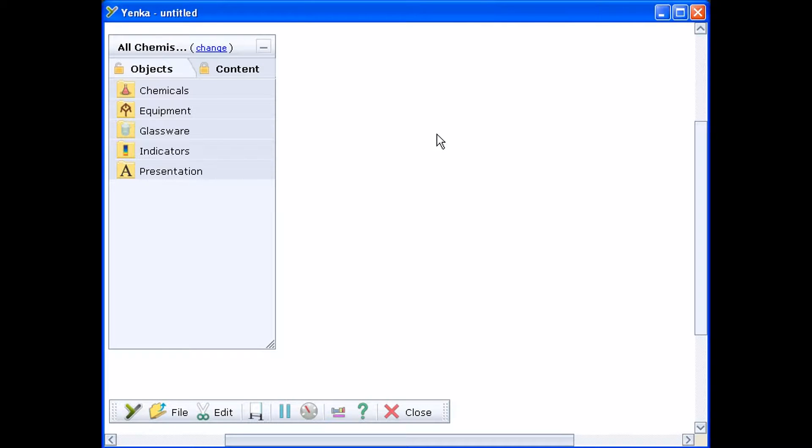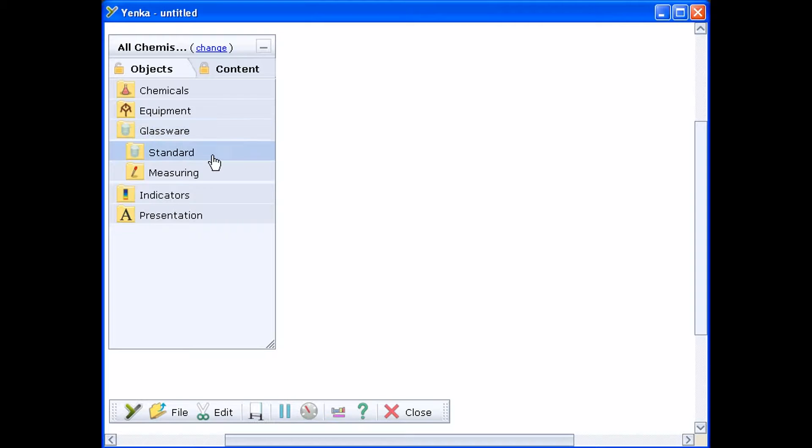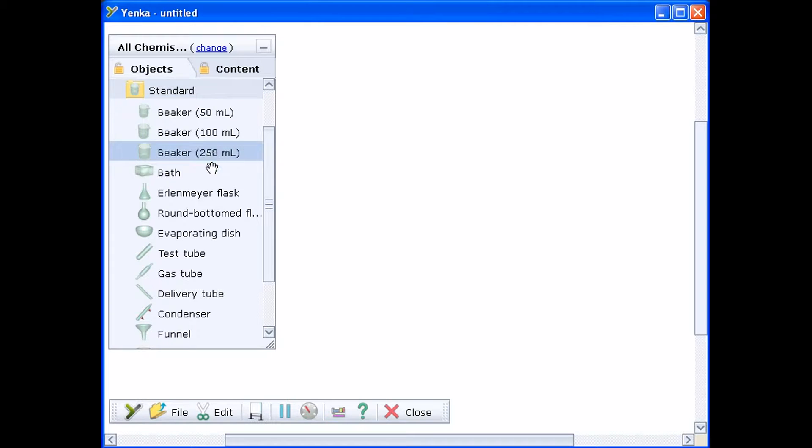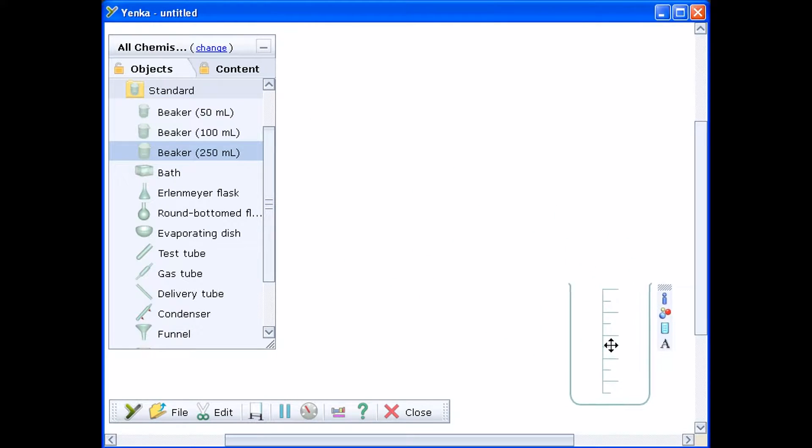This video shows you how to use Yenka Science to simulate electrochemistry experiments. Start by dragging on a beaker from the glassware folder.